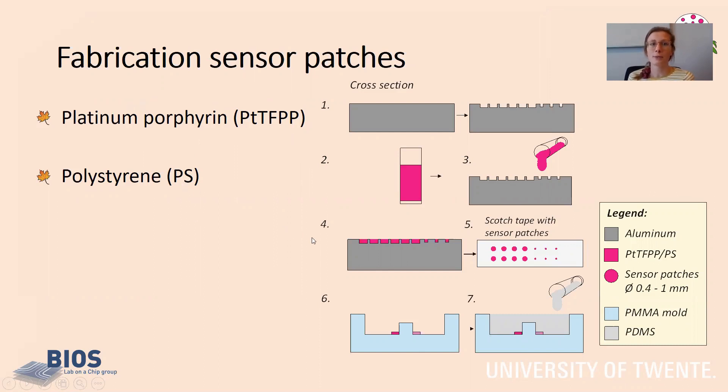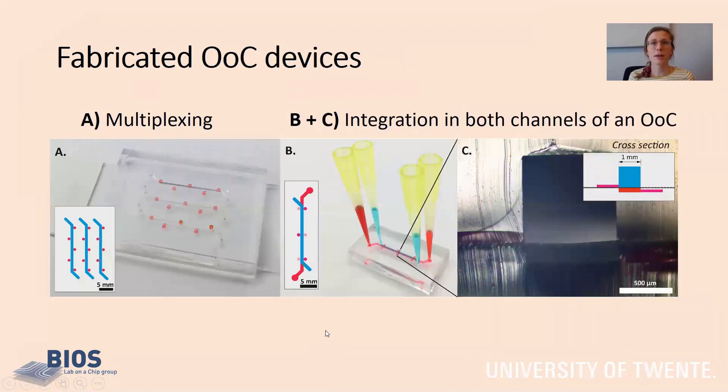Here you see schematically the fabrication process. We have an aluminum mold with cavities in which the sensing material can be poured. The cavities in the mold will become the sensor patches, and these patches can be placed in a mold for your PDMS organ-on-chip. Organs-on-chips are often made of PDMS. With this fabrication method, we created these devices.